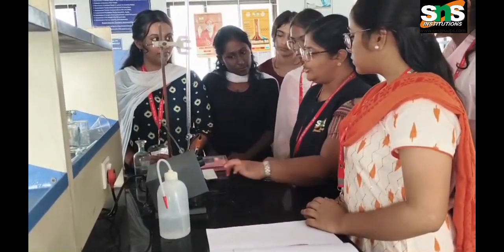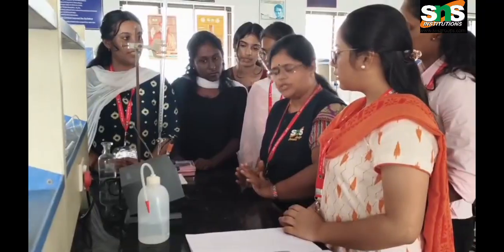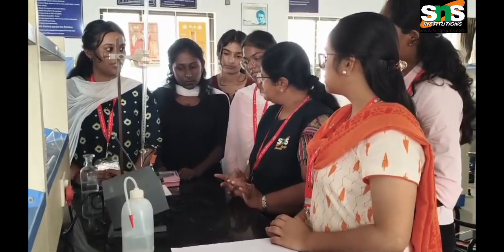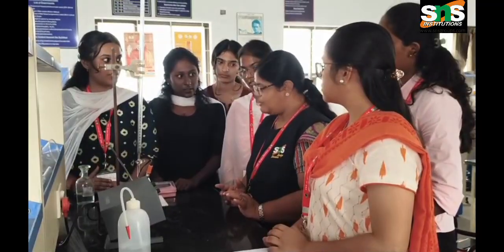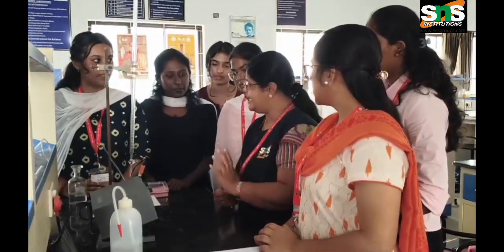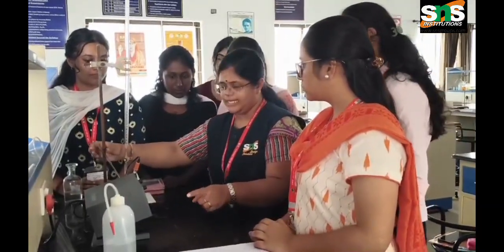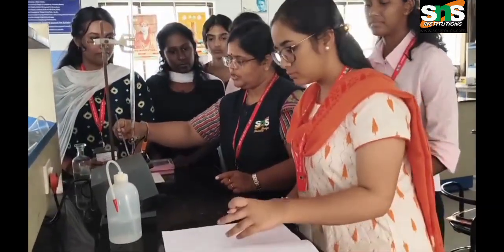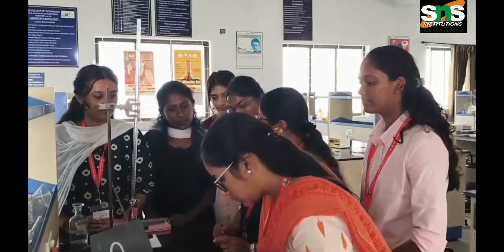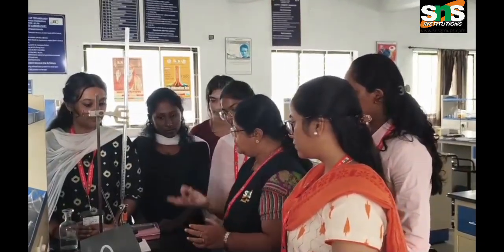What do you think the conductance value will be? What will happen to the conductance value? It decreases. Why? Because the H plus ions are getting neutralized. You can see the value is getting decreased. Note down the value: for 0 ml you have a value, and after adding 1 ml the conductance value decreases.